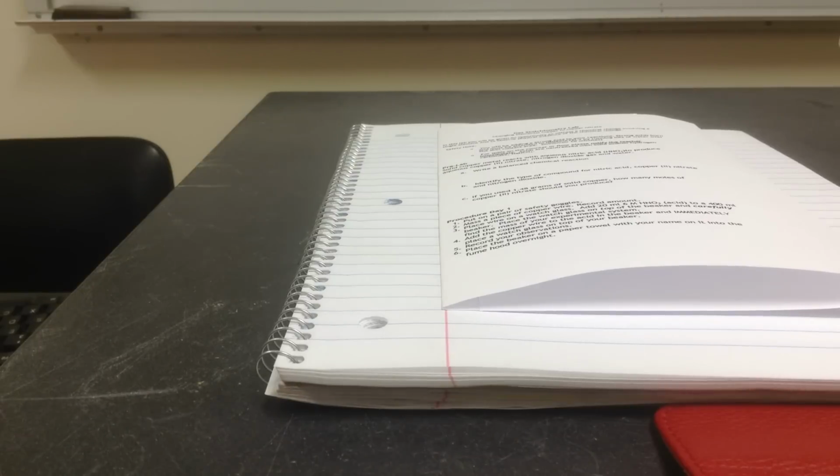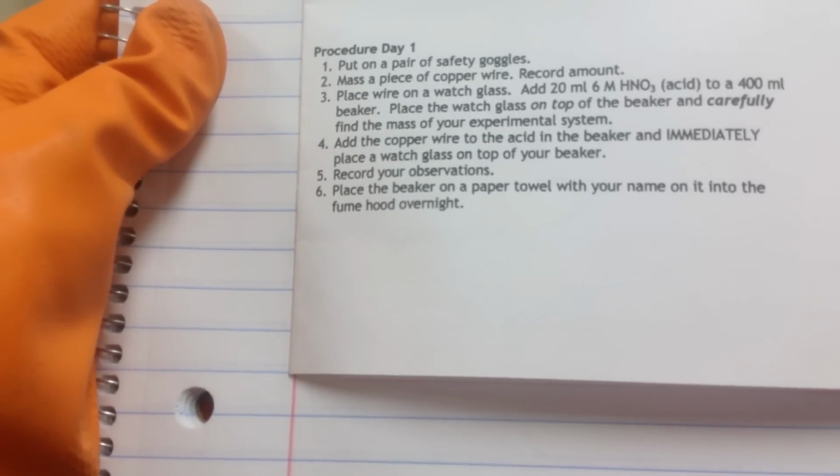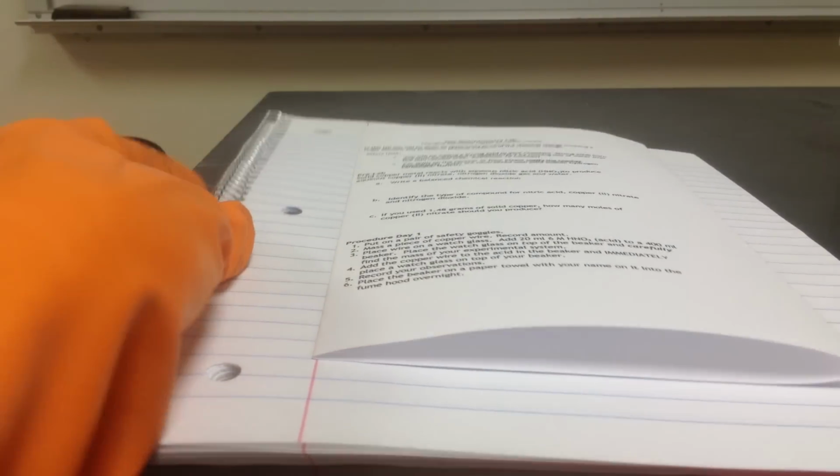Okay, so we're going to follow our procedures. We'll start with step 1, which is always safety. Put on a pair of safety goggles, and I have those on. Can't reverse the screen right now, but they're on.